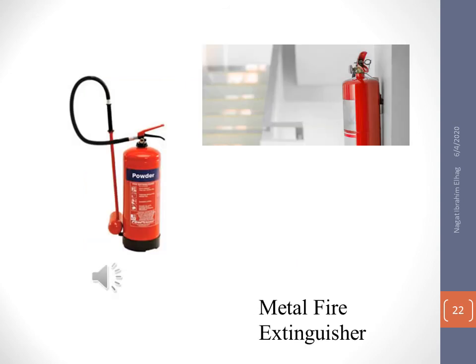As you see here, there is a metal fire extinguisher. It is used in emergency cases of fire, and as I mentioned in the previous slide, the lab workers must be exercised and trained to use this tool when a fire occurs in your lab.